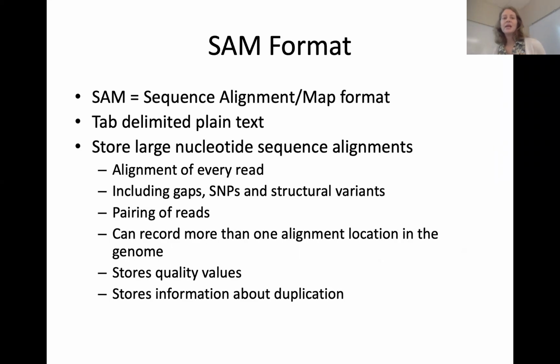Okay, SAM format. This is the Sequence Alignment/Map format. Whenever you map reads, this is the primary format that you're going to get your read mapping back in.